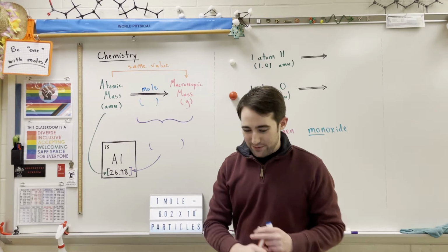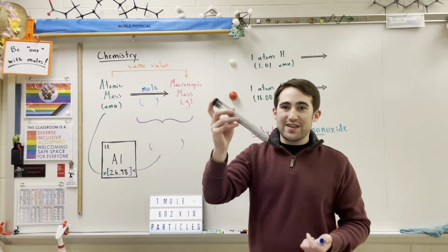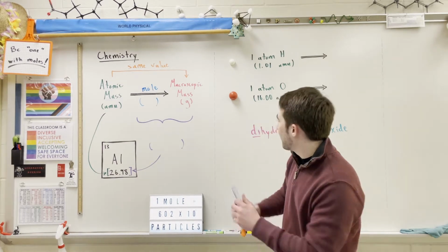So for example, I have this aluminum in this test tube again. Again, this is specifically a mole of aluminum powder in this test tube right here. 1 mole.